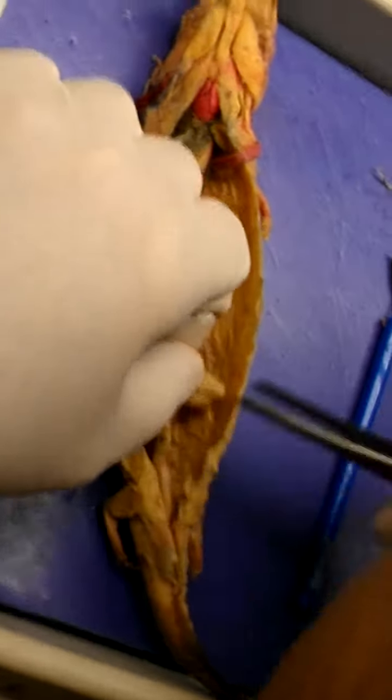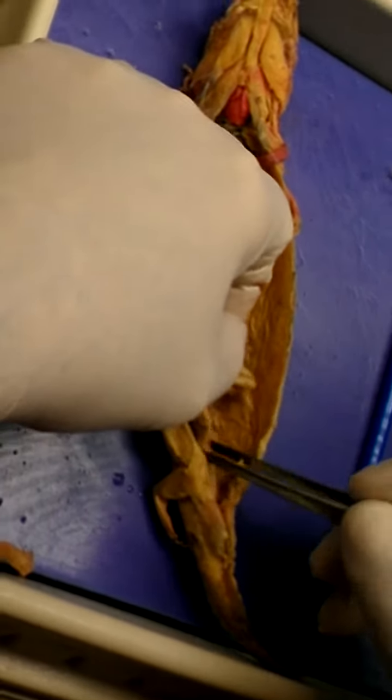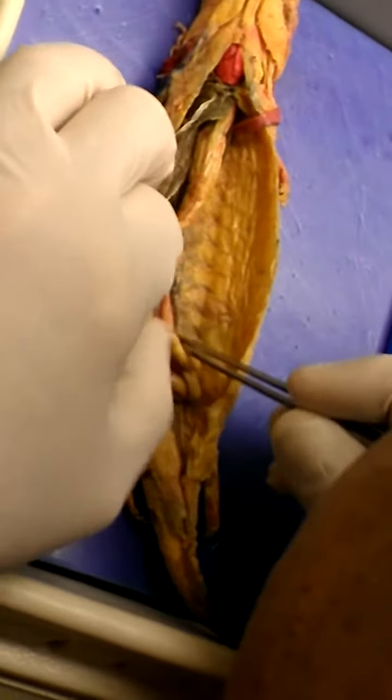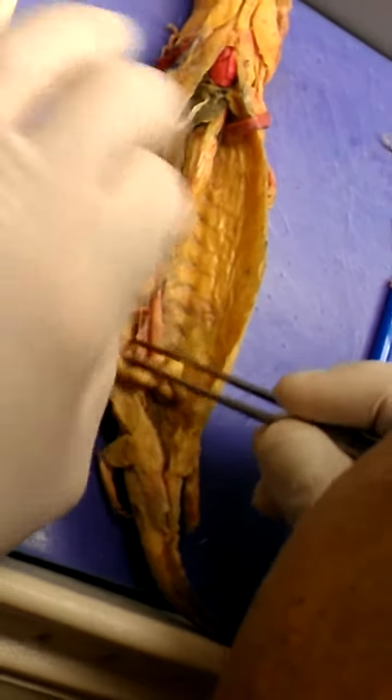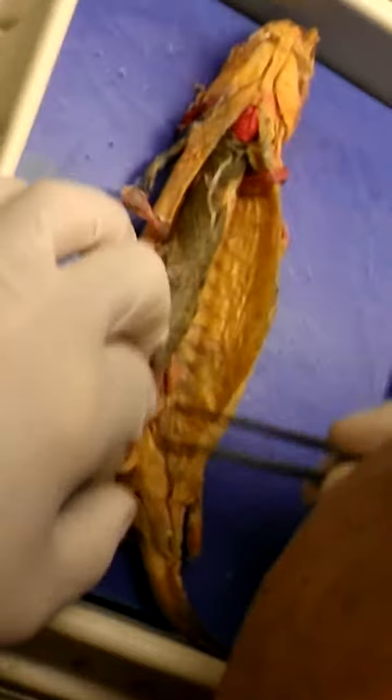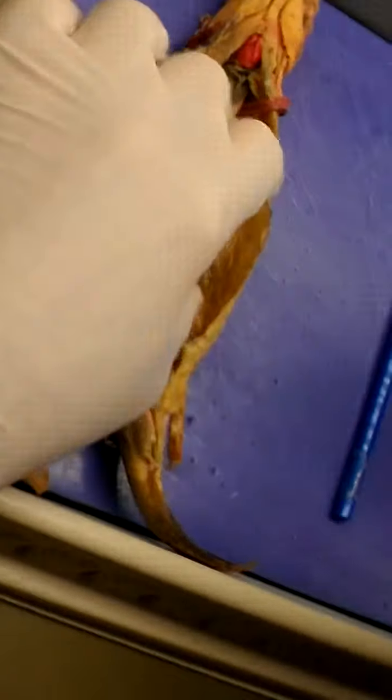If I start to look at the gut here, the gut is simpler. I have the gut tube here. These are all mesenteries holding the gut tube together. I'm going to break some of the mesenteries to take the gut tube out. Not all of them. I just want to pull the gut tube out a little bit. So that's the gut tube there.